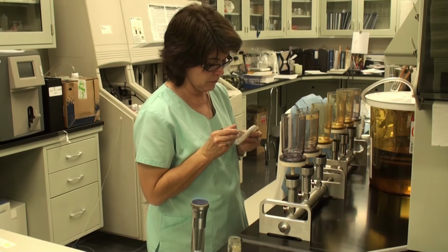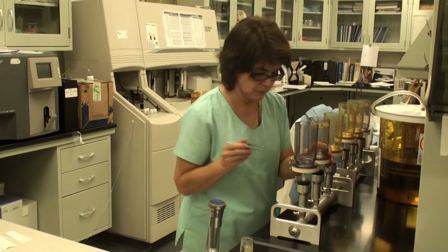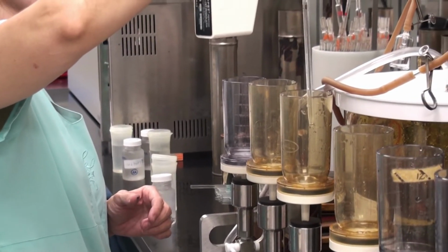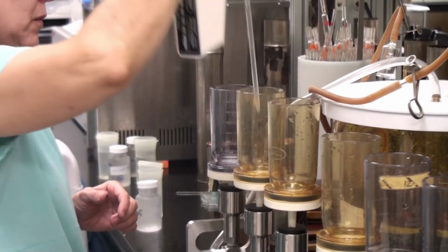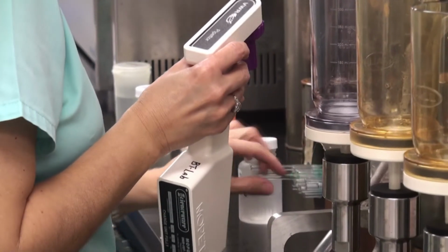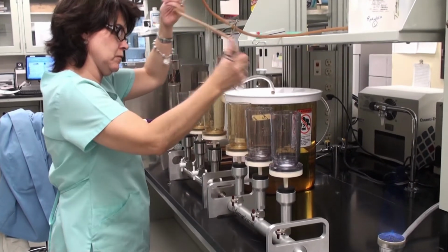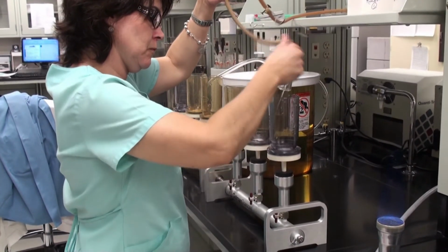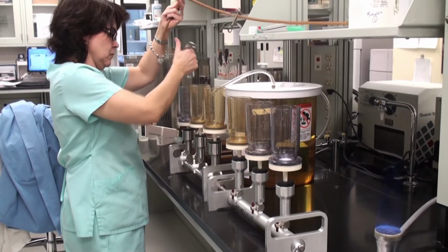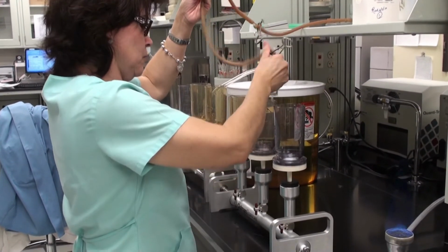Since Mexico's standard for bacteria is expressed in terms of fecal coliform, the lab also performs analysis of fecal counts, which is more complicated and time-consuming than analyzing E. coli. The samples have to be filtered through membranes and cultured in petri dishes. Here, Rebecca Castro from the City of Laredo Health Lab performs various dilutions on membrane filters. She is following procedures required by the National Environmental Laboratory Accreditation Program to ensure quality results.